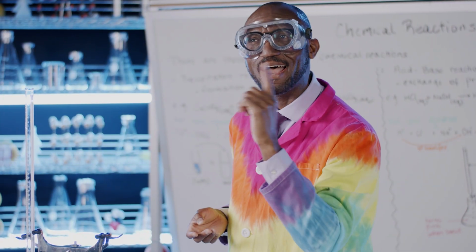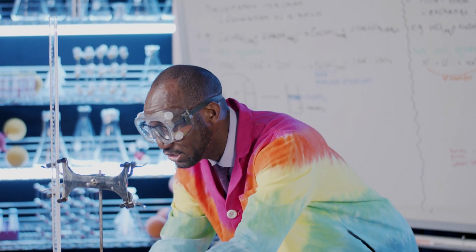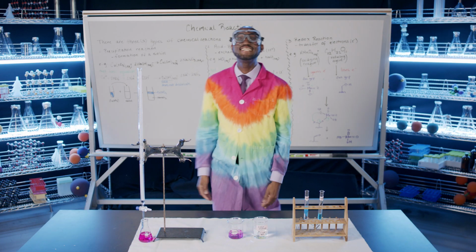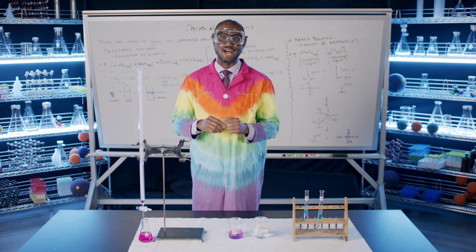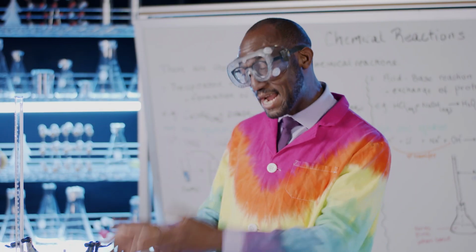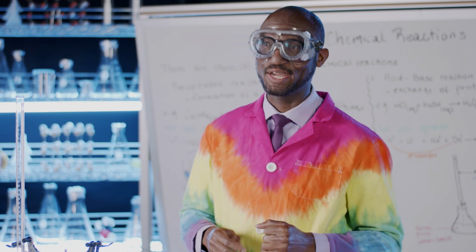But the minute I add more hydroxide ions, the solution will turn pink. There are no more H+ ions left to react with. Excess hydroxide ions remain in the solution, causing it to be basic and hence pink.